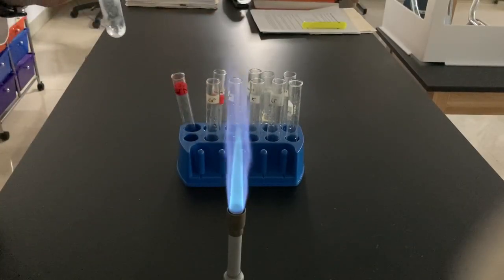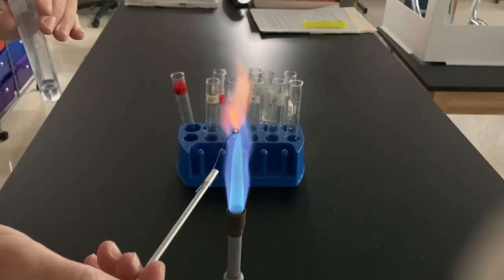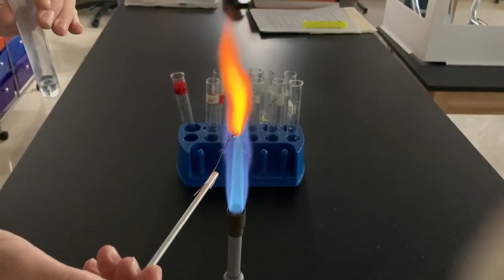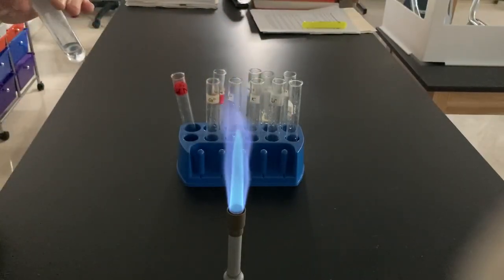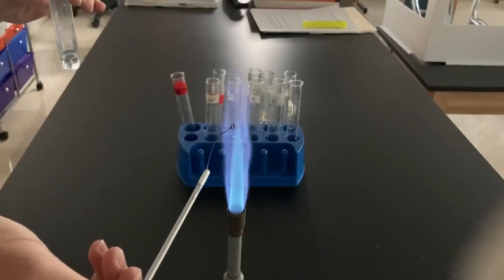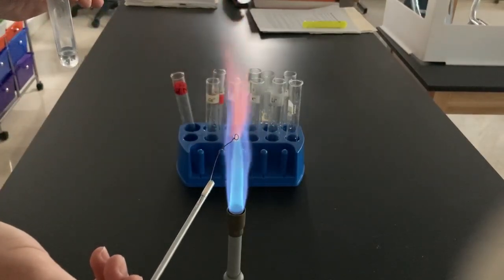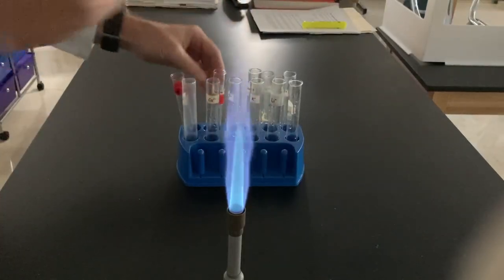Let's start with barium, Ba2+. Now it's just the orange of the wire. Let's try again with barium. Notice it was kind of that initial yellowish color.